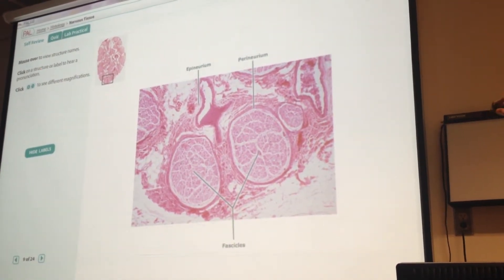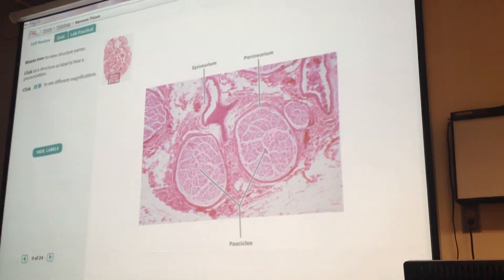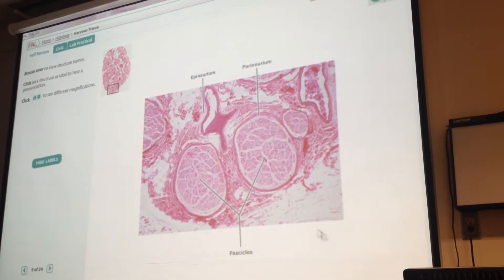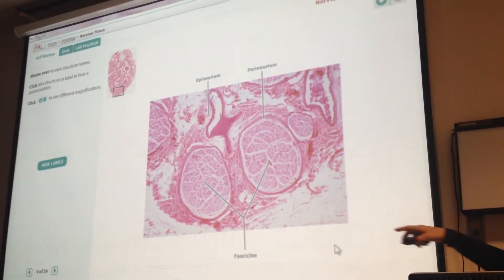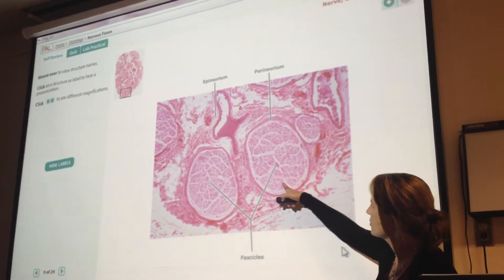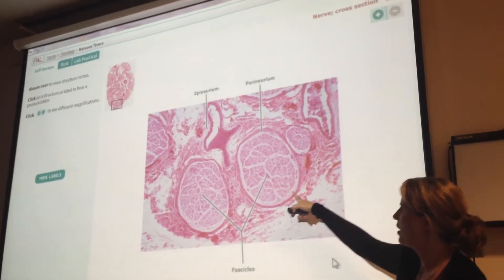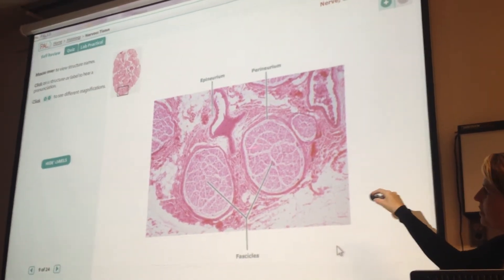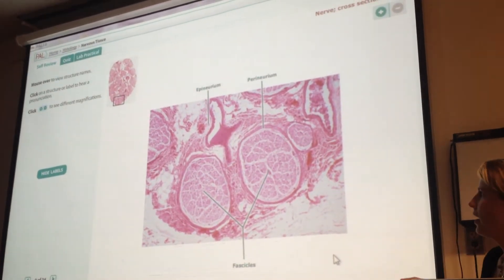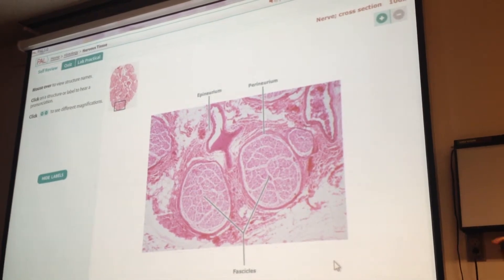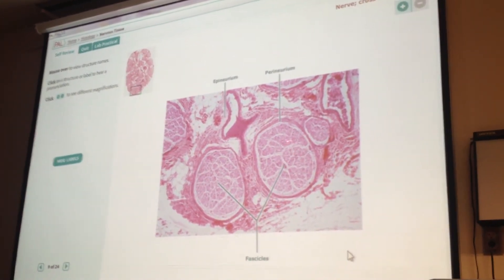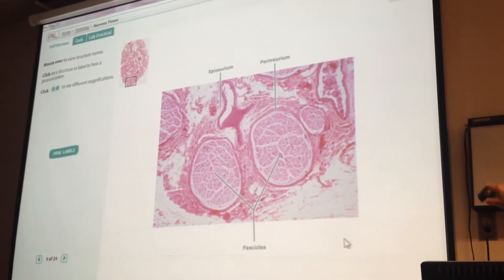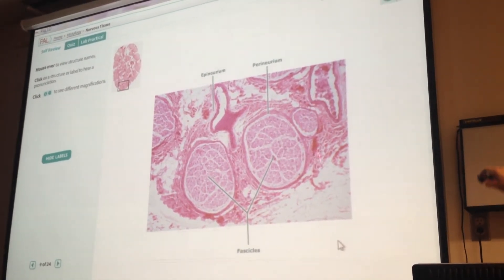So epineurium goes around the whole thing, and then inside you've got your fascicles. Here are the fascicles. Someone was asking why they're kind of separated out like that — I'm not really sure. Maybe in some nerves the axons are more clumped together. You do have the endoneurium around each axon, so it's possible that in some cases the endoneurium is more extensive. But this whole thing is a fascicle, and the perineurium is around it.